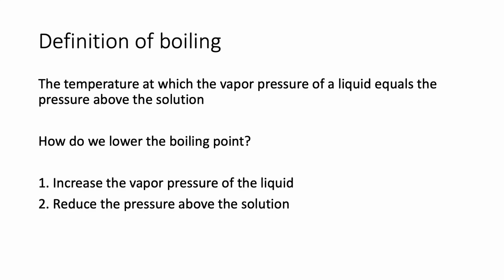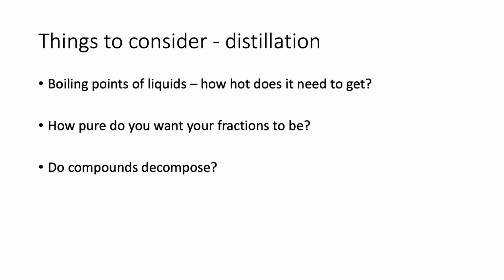So if we heat our compounds too high, so they have a pretty high boiling point, if you remember back or if you look back in your slides, then if we try to heat them aggressively to that boiling point, our products may decompose before we can collect them. So we have to figure out a way to make things boil at a lower temperature.